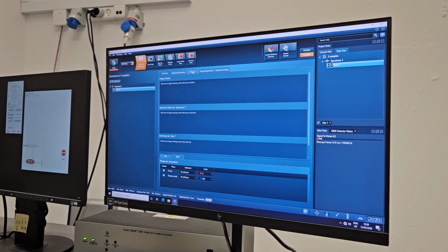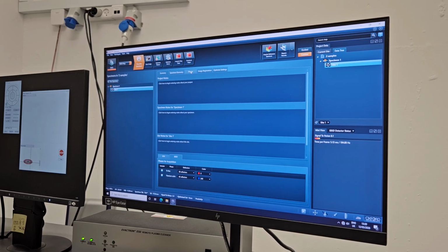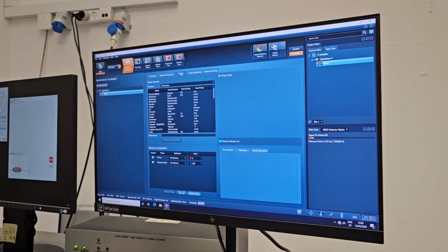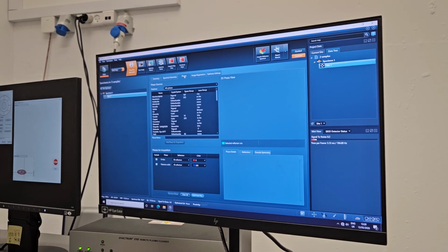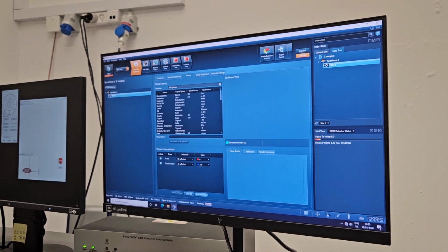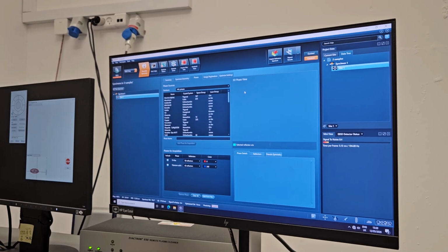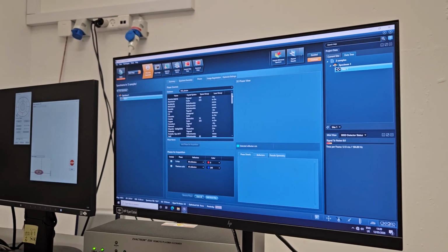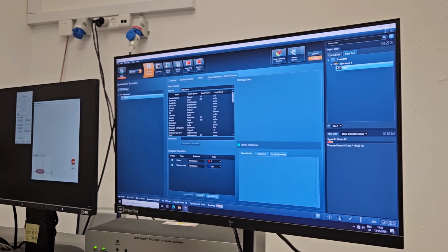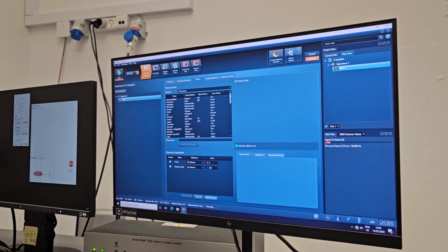We need to find phases that you're going to study. You have many phases. I don't know how many phases you have. And if you don't know which phases you have? You better know. So there are several databases. You need to know what phases you expect. You cannot change that later? No? The software needs this information to find the patterns.